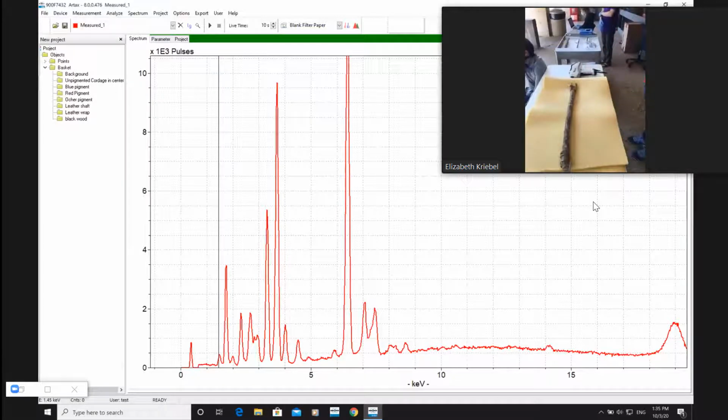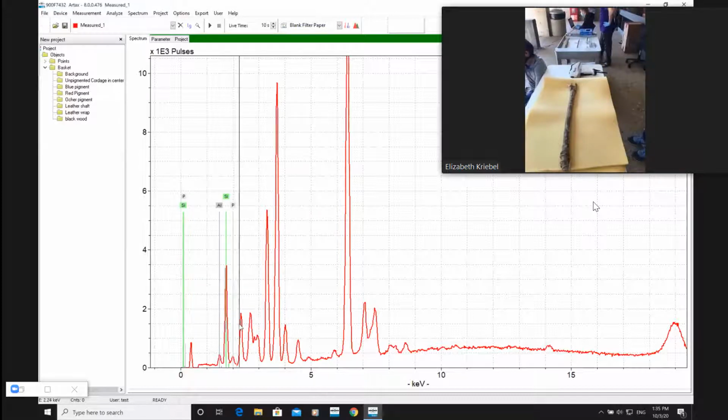So we're going to take a look here. I see aluminum. That's actually too much aluminum to be traced from this guy. A lot of silicon, so there's obviously some dirt that's blown in on this guy. A lot of phosphorus and sulfur. So I would interpret that to be, once again, treated with some kind of animal fats. No chlorine this time, so we don't have a salt-washed object, which I suspect is probably related to its rougher look compared to the other two. Salt washes are great.